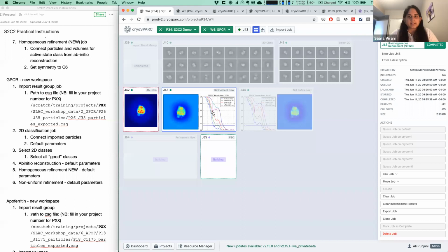In terms of the size of molecules that we can work with, let's say we're working with a small membrane protein, approximately 60 kilodaltons, where it's completely inside the micelle. Is that impossible to process? It all comes down to the ice thickness. 60 kilodaltons is really at the small end of what anyone's been able to show, even for globular, non-membrane proteins with cryo-EM ever, at least with standard hardware. Actually, yeah, pretty much ever. So it's going to be difficult no matter what.